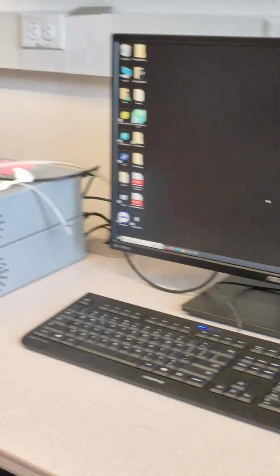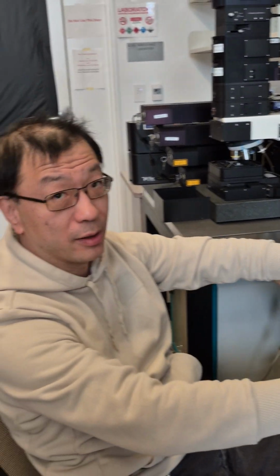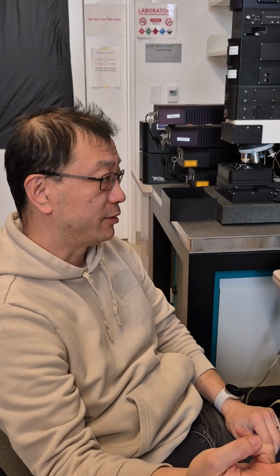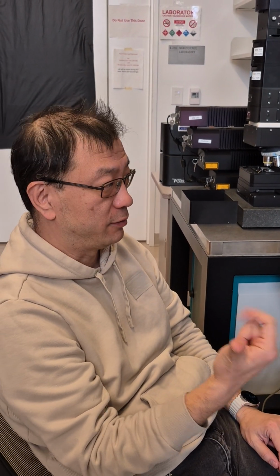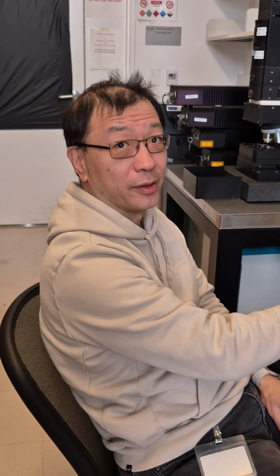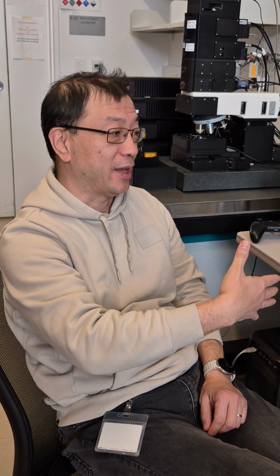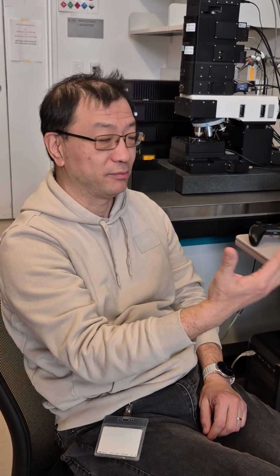This is the server. All the microscopes, all the hardware, like instruments controlled by computer, always have 2 levels of software. One is called server, one is called user interface. The server always runs in the background. So in this case, you must check the server is good. It's up and running. The 6 items must be green checked. And if temperature is not stable, it doesn't matter. We haven't started the user interface yet.